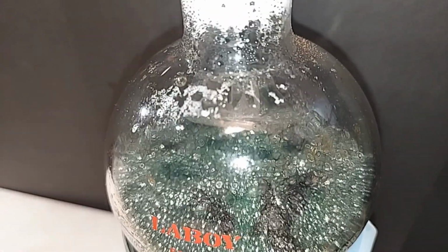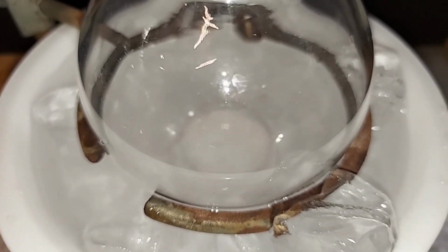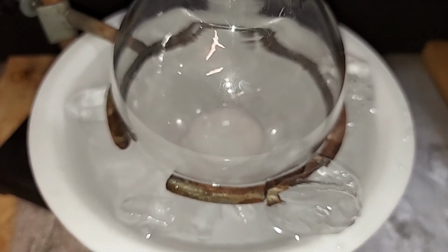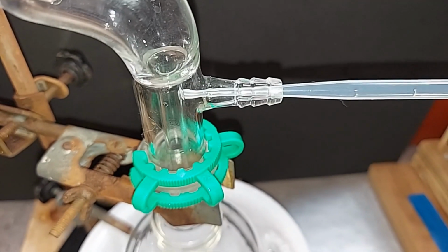And we can see the boiling's going on nicely. The vapors are coming down here, the formaldehyde, and they're ending up in here. But there's a problem, and that is the amount that was in there earlier was more. There's now less in there. So it's evaporating, even in spite of the ice. I don't know what the percentage of the formaldehyde is, but I think it's pretty high because I'm losing it instead of getting more. It was venting through here, I'm guessing.